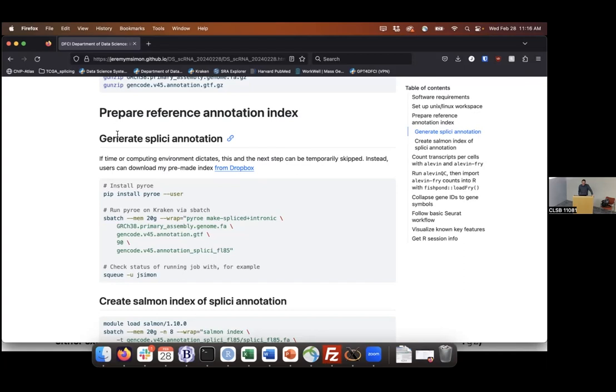My very basic understanding is that it follows the same math as the birthday problem, in the sense that it's not just the pure combination of the number of nucleotides, four to the n, but you actually get barcode collisions more frequently than that, based on how many barcodes you're sequencing.